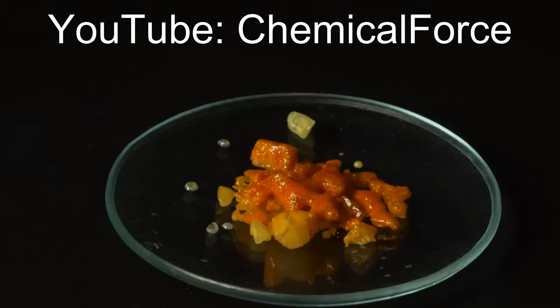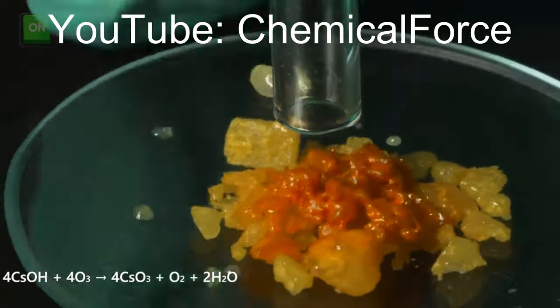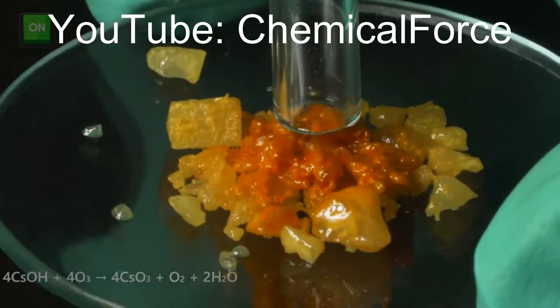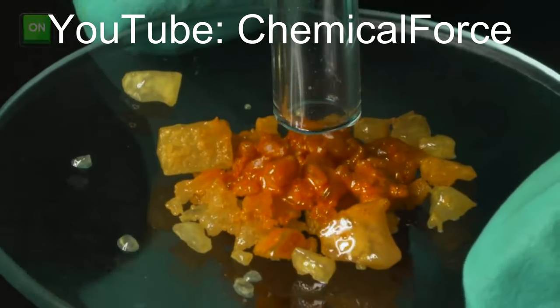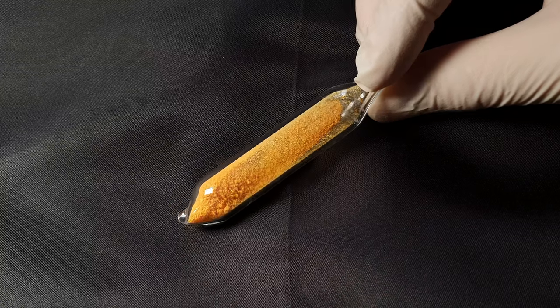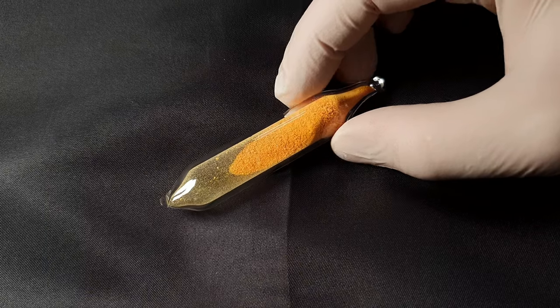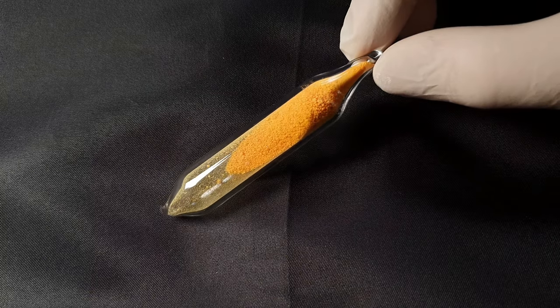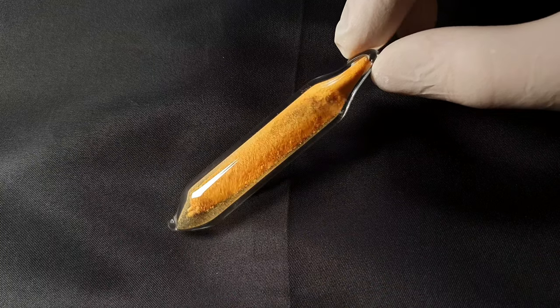The difference between his method and my method will be the precursor. Chemical Force was using cesium hydroxide, which forms water when reacting with ozone. The water that forms immediately reacts with the ozonide and it decomposes. I will be using cesium superoxide — the same cesium superoxide I made in my last video. In the reaction between the superoxide and the ozone, no water is formed, so there is no water the ozonide can react with.